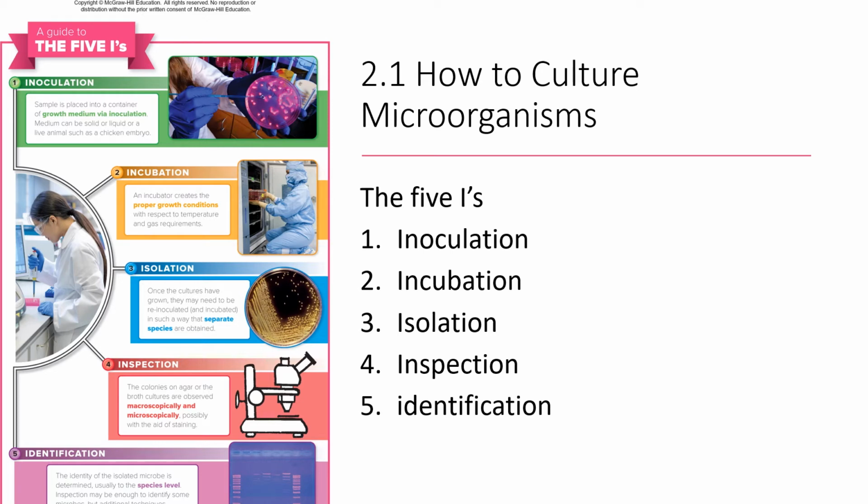Now, as we approach this, we want to think of microbiology in the laboratory setting with the idea of the 5 I's: inoculation, incubation, isolation, inspection, and identification. We're going to go through each of these individually in this chapter and discuss in generalized terms what that means, what it takes.